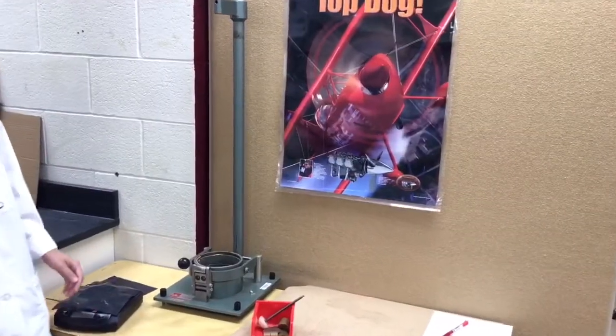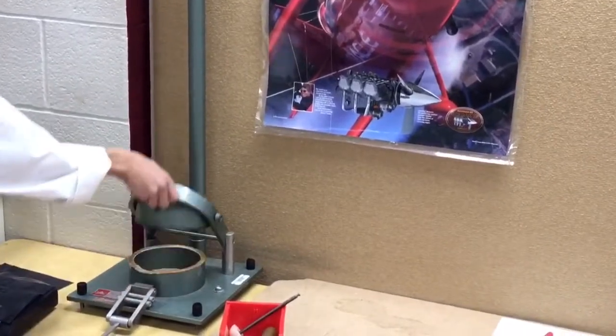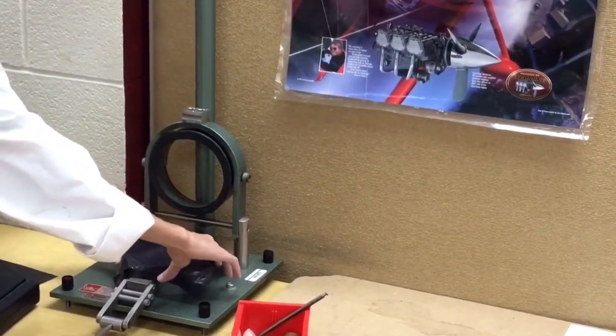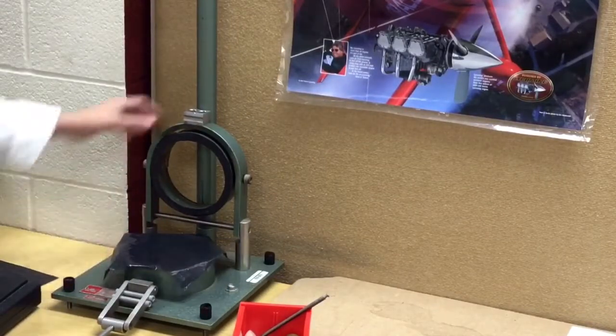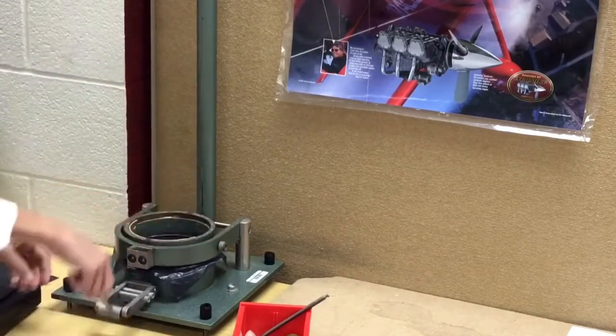To start we'll look at the film clamp. You'll want to carefully unload the clamp and open it. You want to carefully load your sample and make sure that it does not go over the edge and keep any of the area underneath the ring exposed. After it has been covered, carefully close the clamp to prevent any finger injuries.